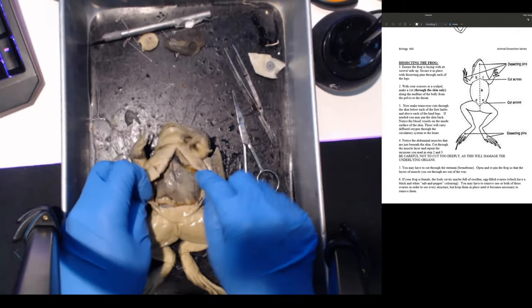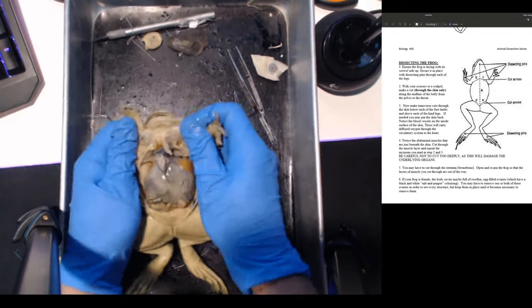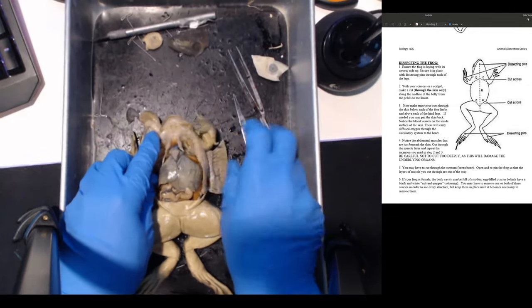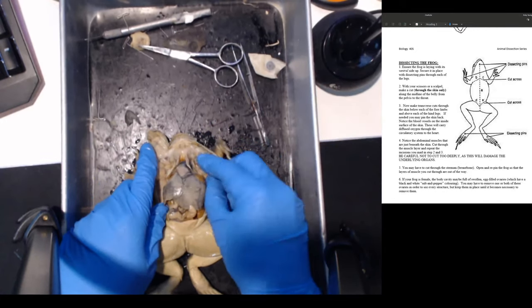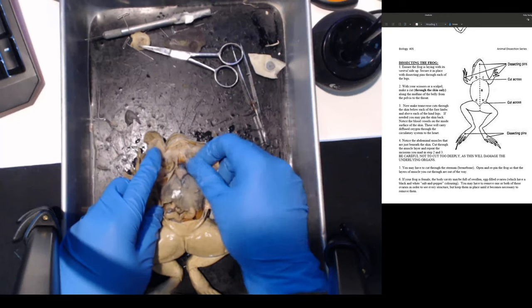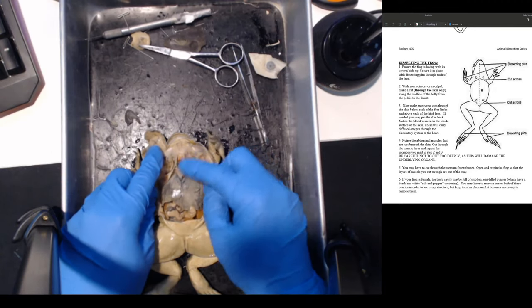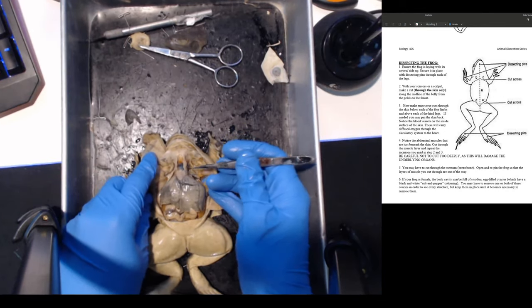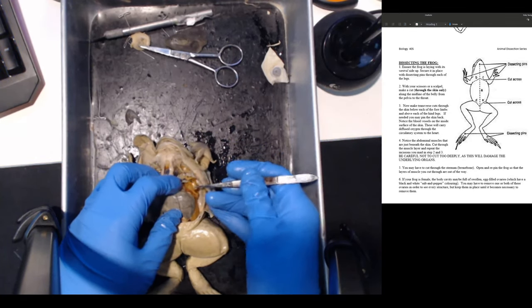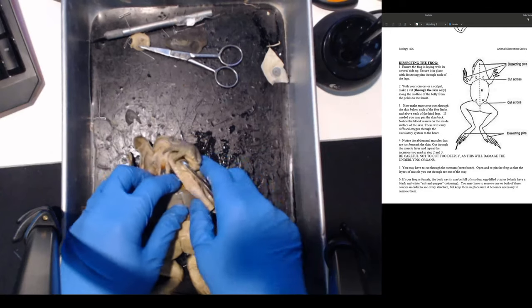More advanced organisms have this body cavity where things are separated - you have skin, muscle, and then this body cavity. I'm peeling the skin all the way back to the mouth. What can you guys see? If you look at this - there's that orange: those are your fatty bodies, within various parts of the body. These fatty bodies are quite conspicuous when you open it up - all that orangey-yellow stuff.